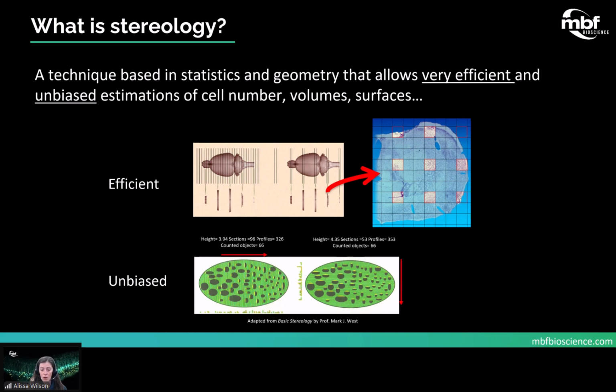If you are using a whole region acquire, then you would be acquiring all the images shown in blue. So you would be acquiring all of these adjacent images and stitching them together. This can be done using Stereo Investigator and Neurolucida and using the slide scan workflow. Or if you have a whole slide scanner that can acquire in 3D, that can be used as well. And lots of other options. We are able to support lots of different image formats.